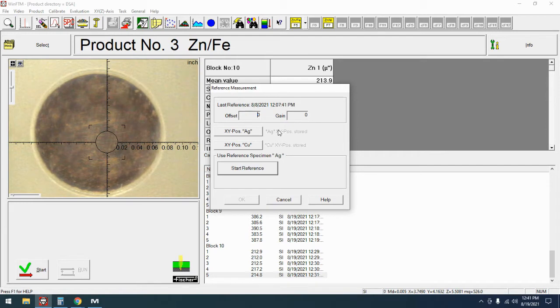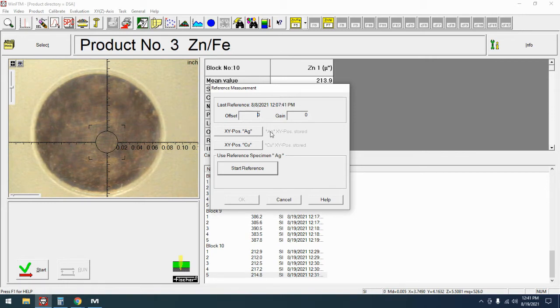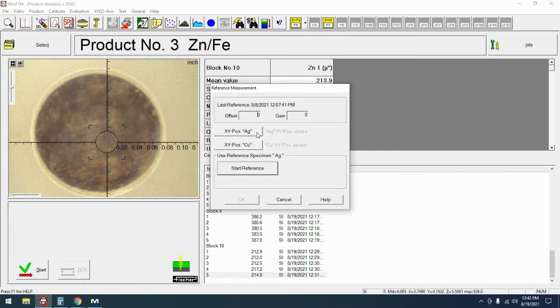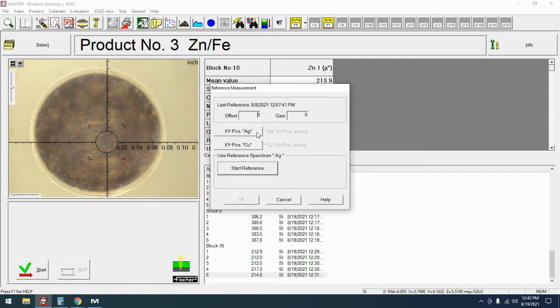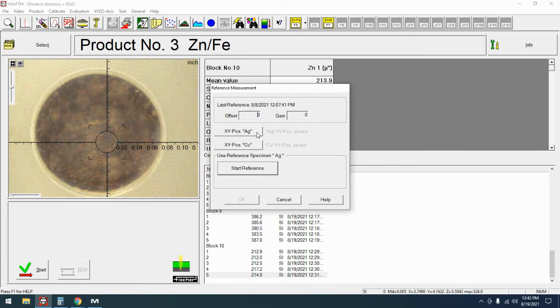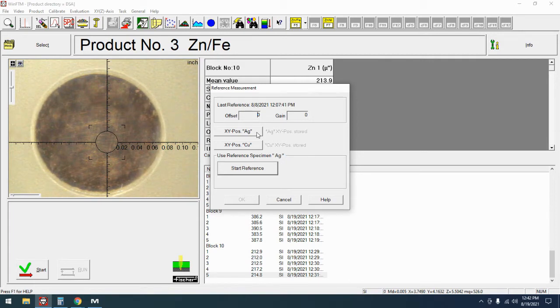I have this hooked up to an XDL with a programmable stage so I'm going to show you also how to program in the X and Y positions of your two elements. This will automate that and make things just a little bit easier and quicker because I won't have to stand here and watch it the whole time. If you don't have a programmable stage obviously you're going to have to manually move around your element card.